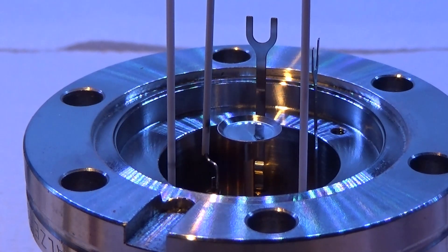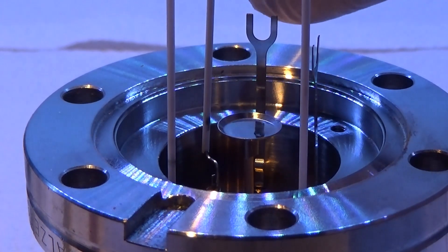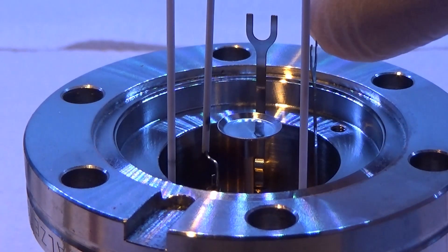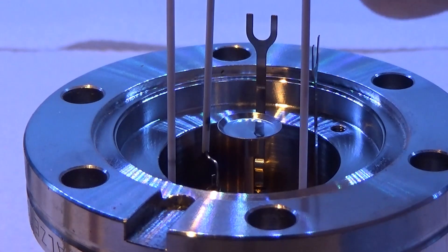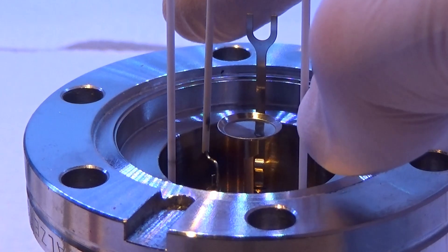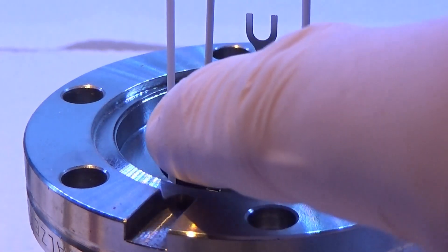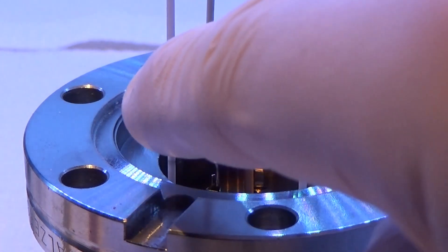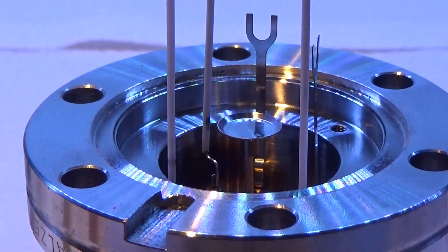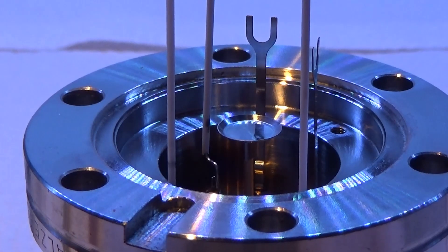So that's basically the system. As you can see, there are only six connections. Quadrupole rod one, quadrupole rod two sets. The two long wires here is for the filament. The little tiny tungsten wire on the top. This one is for the accelerating voltage of the ion source. And then there's the collector plate, or Faraday cup. That's it. That's a mass spectrometer.